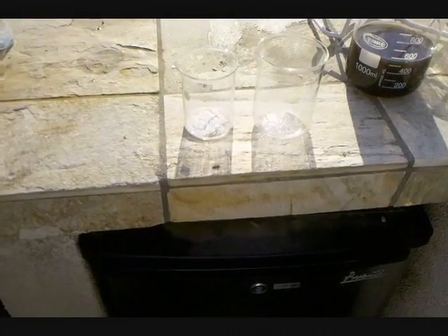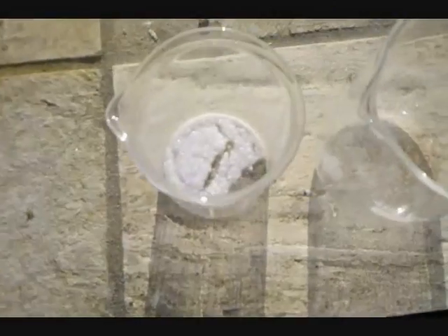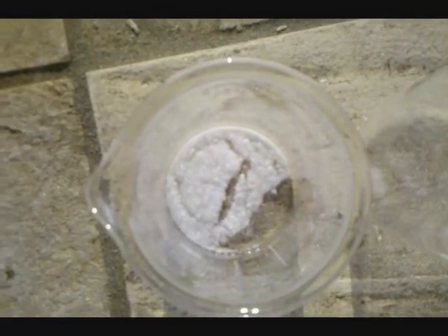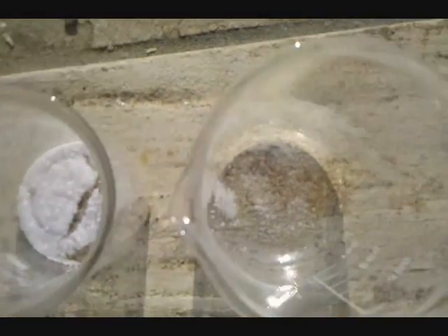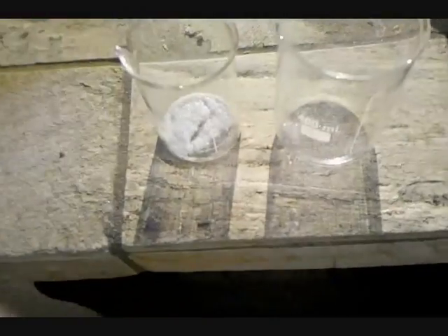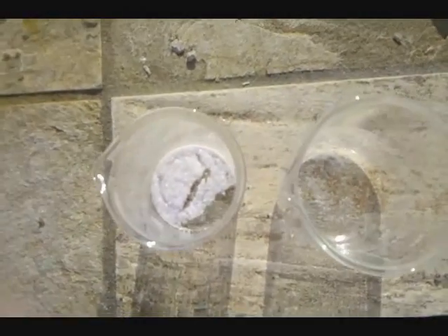Here we are — finished product. The beaker on the left contains the potassium periodate. I poured off the solution into the beaker on the right, but decided there were enough crystals remaining that I would try to save them. So I'm letting both dry out and then I'm going to collect my product.